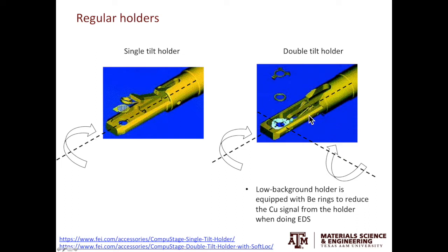For the double tilt holder you place your specimen here, secure the specimen with the washer and the clamp ring. You can tilt the specimen like what you do with the single tilt holder. In addition you can tilt the specimen orthogonal to the long axis of the specimen holder.